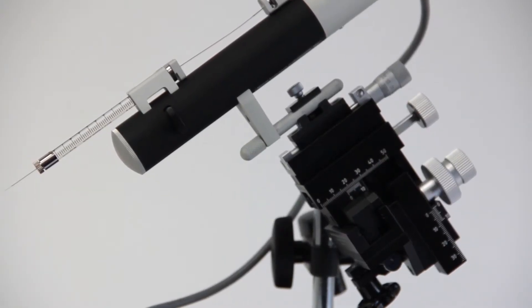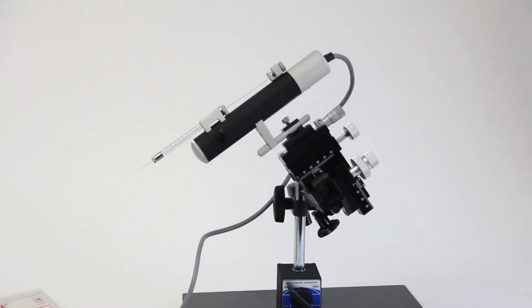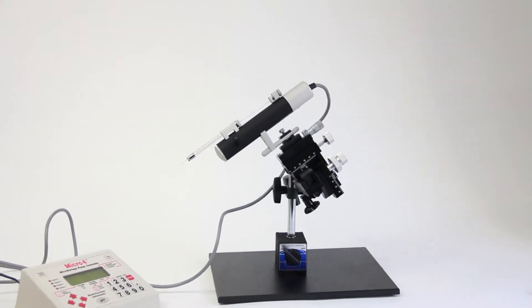Next, we show the UMP3 mounted on WPI's M330-01 micromanipulator. And finally, we have the micromanipulator mounted on a tilting base with the UMP3 again mounted on the micromanipulator.